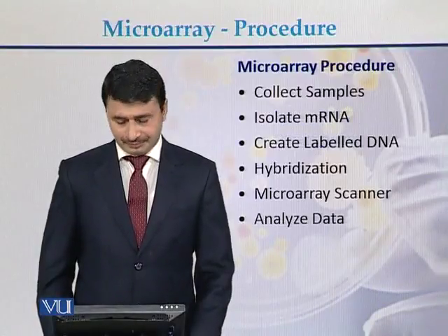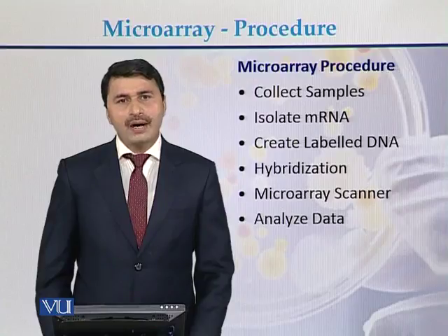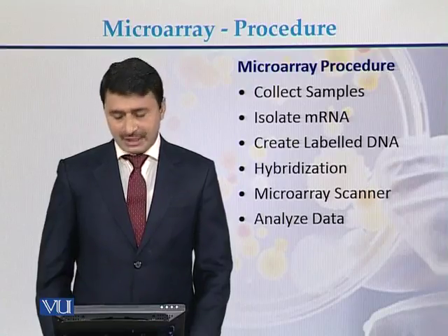Microarray procedure. During this lecture, we will study the procedure of how microarrays are performed.